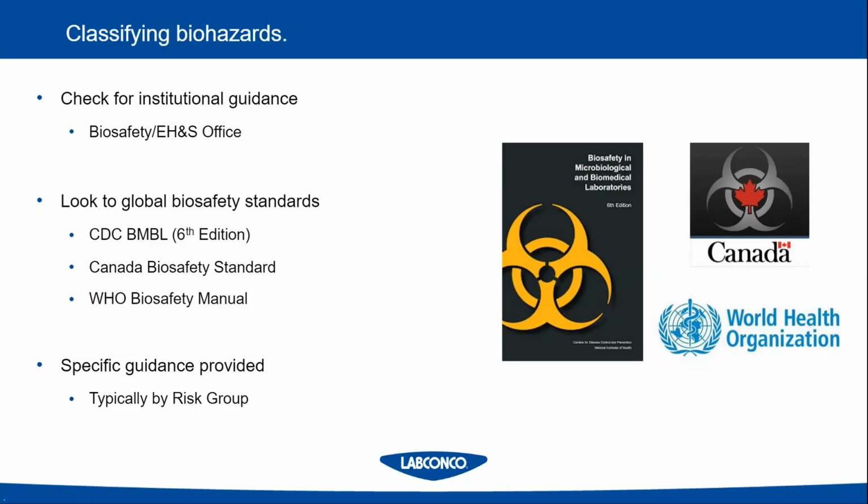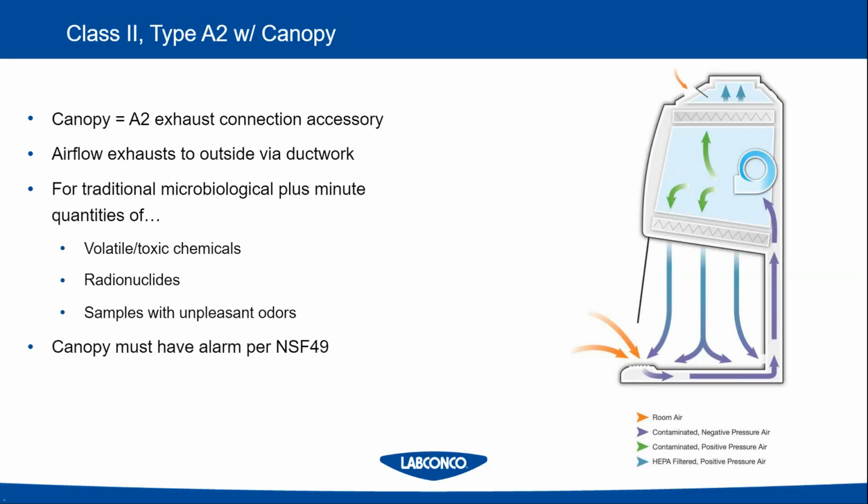Great, so I will show you this slide here. So when a type A2 biosafety cabinet is exhausted, and you can see the canopy on top, this is when the guidelines allow minute chemicals.